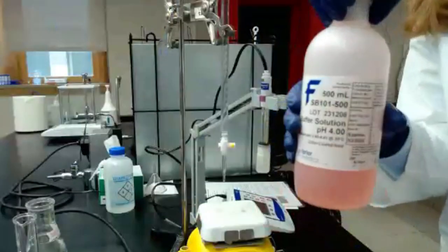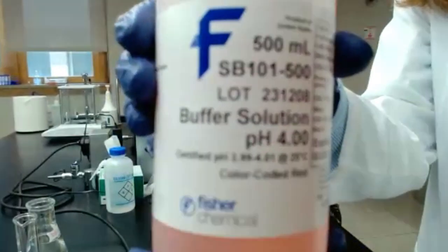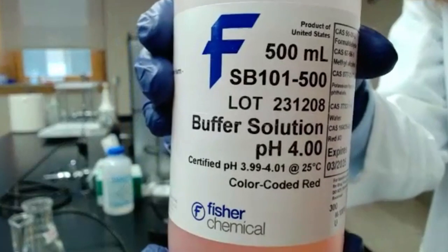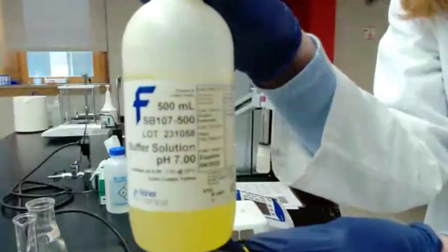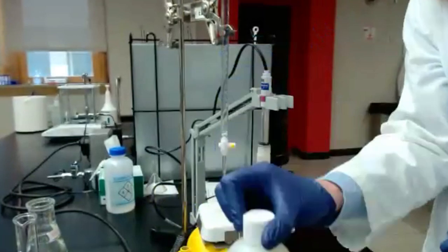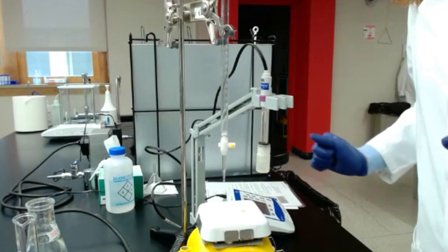Here in our lab, we have 2 different pH buffer solutions. We have pH 4.0, that's a standardized buffer solution, and we have pH 7. And that's really the first step. When we do any measurement with a pH meter, we always start with a calibration of the pH meter.